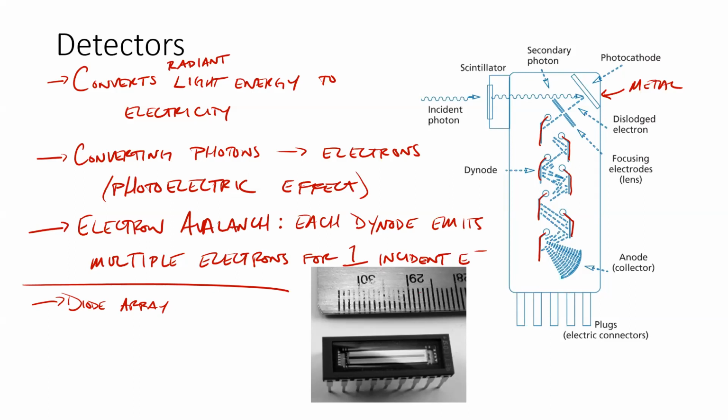If we can wire it up to emit light, we can also wire it up so that it converts light back into energy, right? So into electricity. So LEDs convert electricity into light. These detector diodes convert light back into electricity. And so this particular one is real small, obviously.